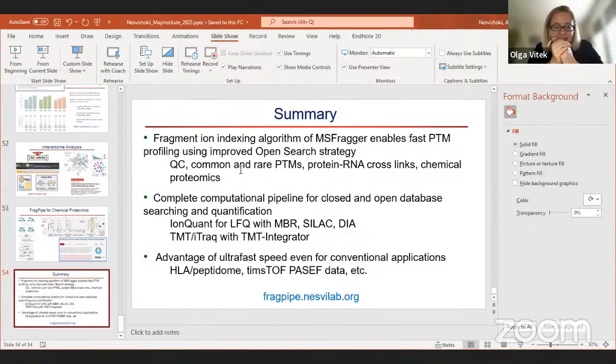So another question, Silas is asking, for curiosity's sake, how much of the data from a typical proteomics run, for example DDA on Orbitrap, is explained by standard search settings? Or how abundant and common is it to find PTMs in typical standard proteomic data?